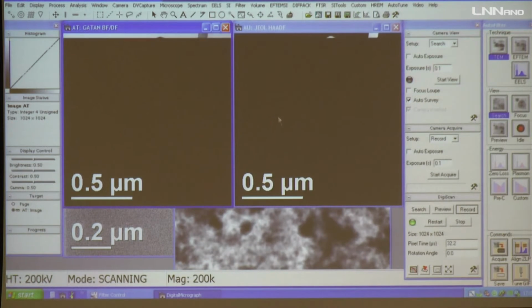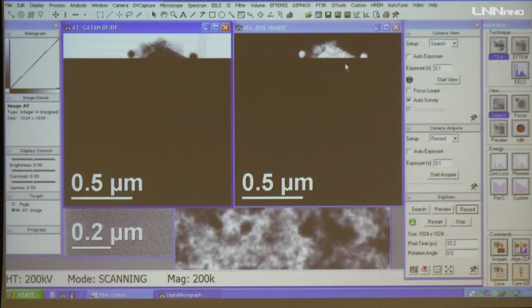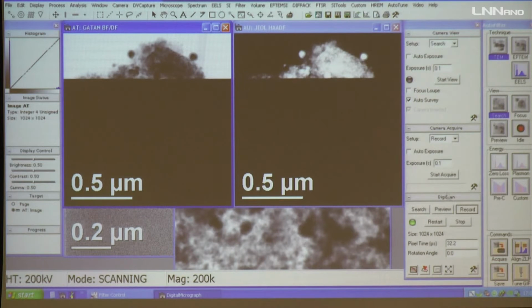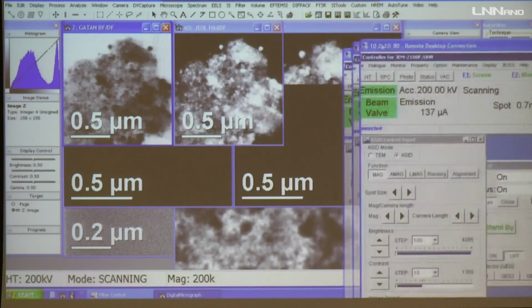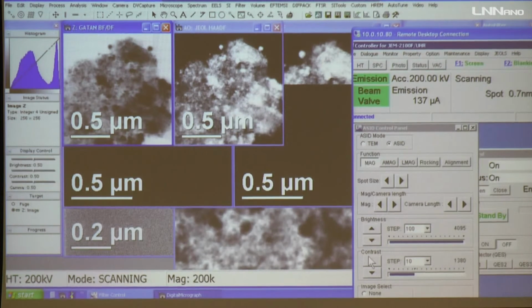Okay, I will ask here for the acquisition. And it's interesting, we can see here, if I try to make the contrast well distributed, I ask for a smaller contrast, then I start to have dark regions in the image that actually were in places where I have material, but because of the contrast here, I cannot see the image. Yeah, I start to make it flat. Okay.